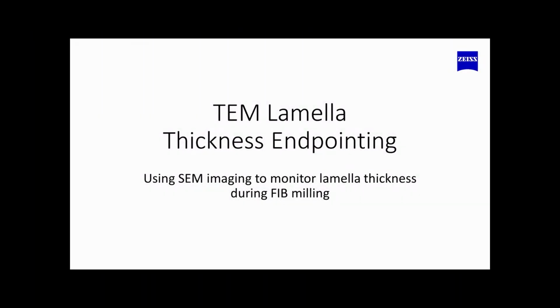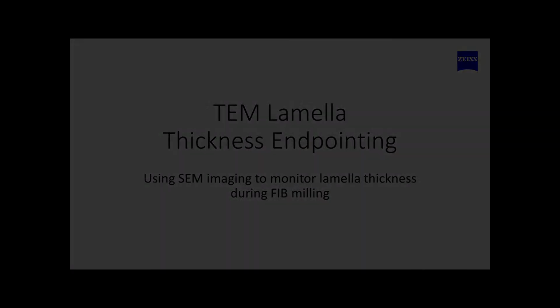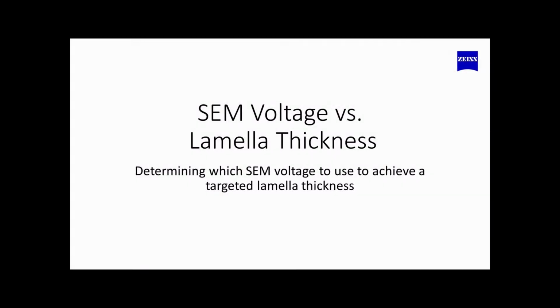All right, and that's the final result. So for the main part of this, I'm going to show the workflow for a TEM lamella, specifically for thickness endpointing. In this case, I chose to do silicon.